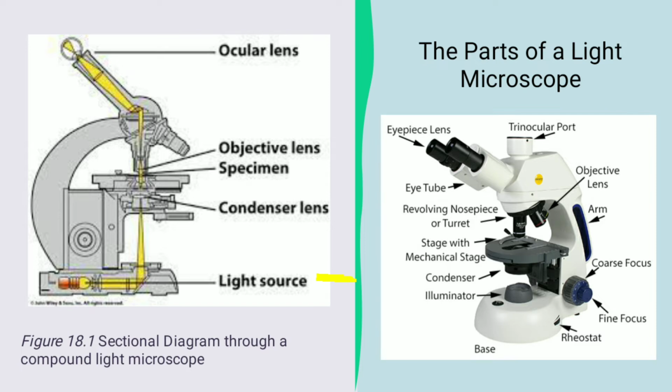Next, the light travels through the tube of the microscope and the eyepiece, which further magnifies the image by a factor of 10 or 15 before it finally enters the eye. Also, it is important to remember that some light microscopes can magnify an image up to 1,200 times its original size. So it's very amazing, di ba? The stage of the microscope is placed for observation. The stage clip is designed for the specimen to be in place. So para intact.